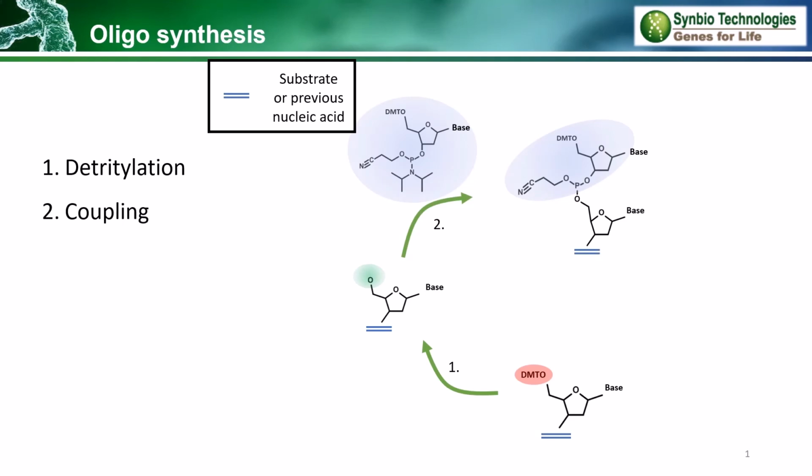This is where the amidite is activated with a mild acidic solution. Next, the amidite is added to the existing 5' hydroxyl group of the previous base. Since this chemical reaction tends to be around 98% efficient, the non-reacted groups must be acetylated with a capping solution, such as acetic anhydride or N-methylimidazole. This prevents additional amidites from being added in later reactions, thus preventing the formation of mutated oligos that contain deletions, as these would be nearly impossible to purify.